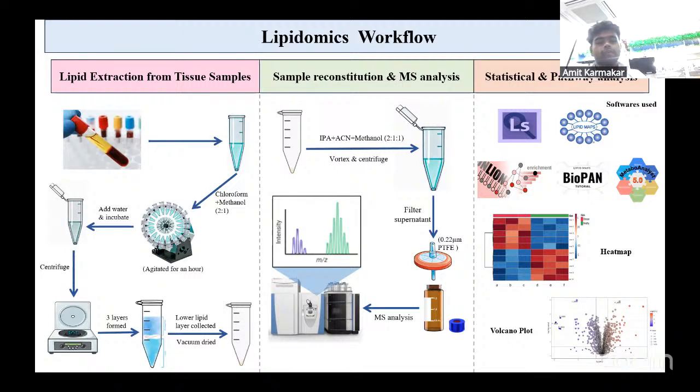So right now, I am going to show you what we generally use in our lab to process the samples for lipidomics and metabolomics.